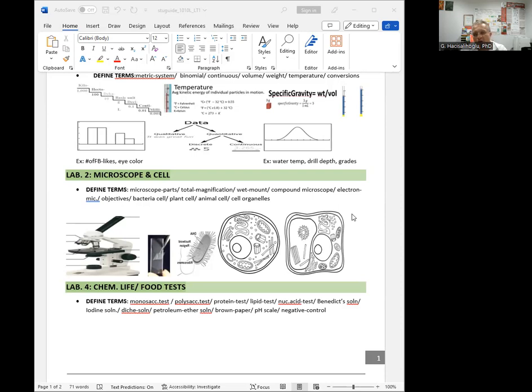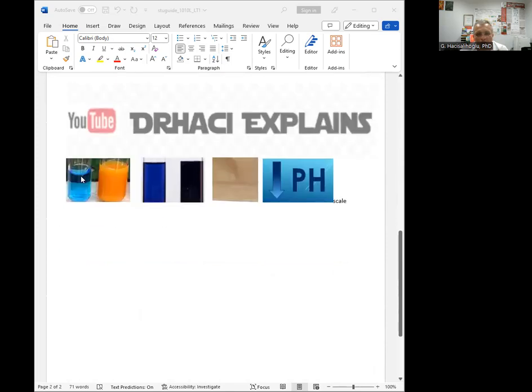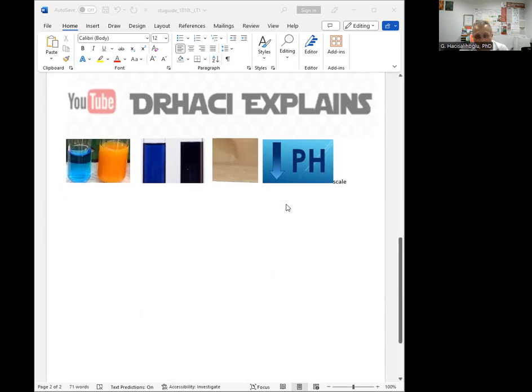You did an experiment measuring the pH of a number of items. Also always remember in every experiment, you have a negative control, which is usually water, which is usually your very first tube, number 1. So go over and review and make sure that you pay attention to these color changes, orange or no orange. If you're looking for orange color, any other color is not correct. Then orange is your positive result, or black is your positive result in another experiment. And for pH, we measure it using pH paper.